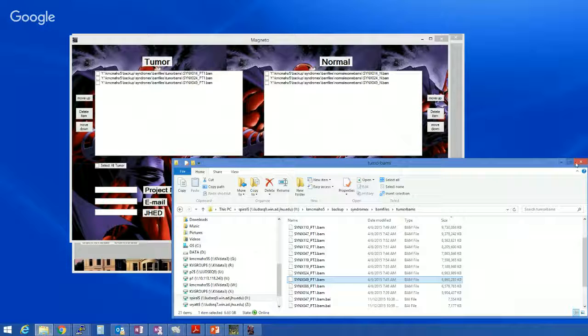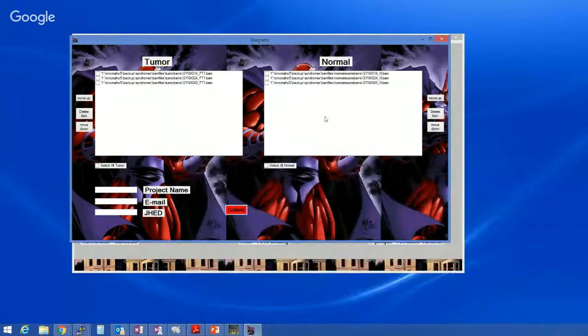Okay, now let's go through. I'm going to go ahead and close this down because I feel comfortable with that. Let's go through and make sure we got 14 N paired with 14 PT1, 24 PT1 matched with 24 N, and then 49 N matched with 49 PT1. Those all seem to work out. So we're going to just select all.